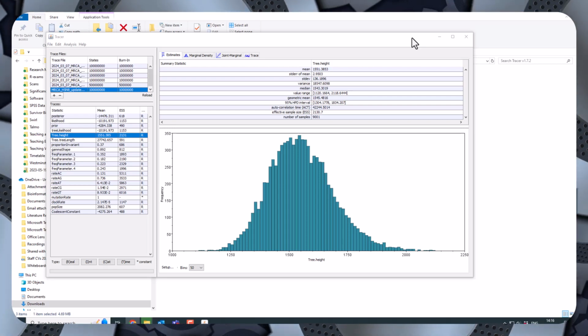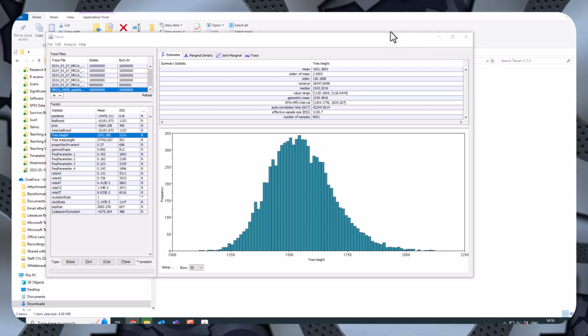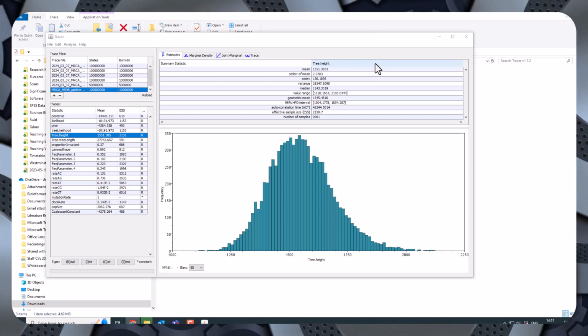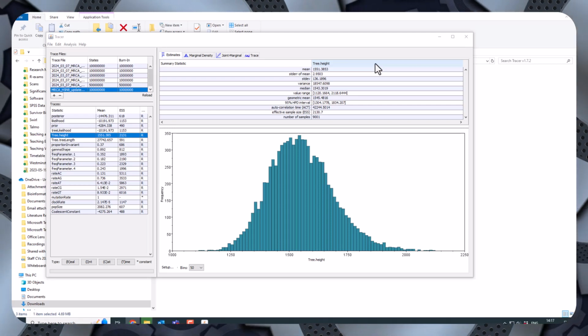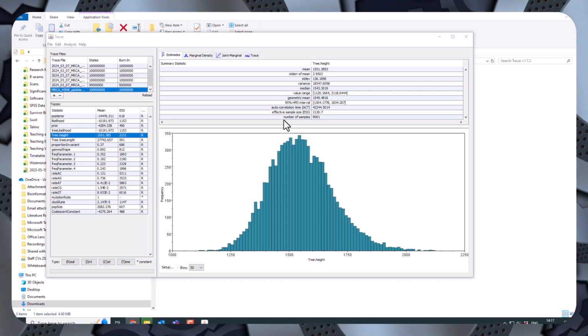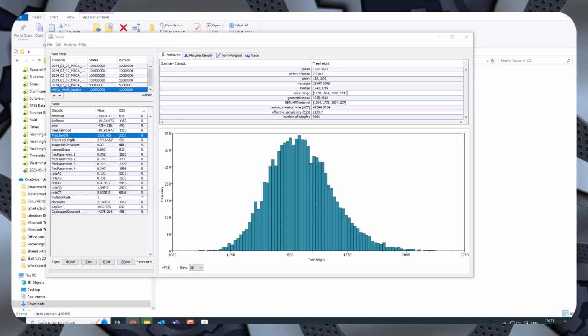So what puzzles me is, if we got a sudden outbreak of bird flu, like we did here, why did the originating event come from so far in the past? So it looks to me like I've made a bit of a mess up in the data that I've collected. So it looks to me like at the site where you collected the data from the outbreak, you have sequences which are from the outbreak. But you also have another set of sequences which are not part of the outbreak but happen to be there at the same time, which is a bit inconvenient, to put it mildly.